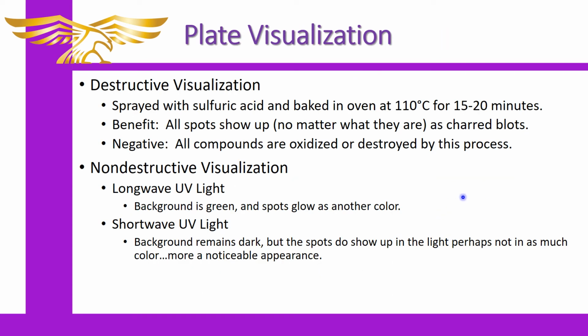Now, once you've set up the spots, of course, you place it in the chamber and you let solvent travel up. And then when the solvent is done, you mark the solvent line or the solvent front that traveled. And there will be some example slides that show you what I mean. But once that's done and it's dried, we go to visualization.